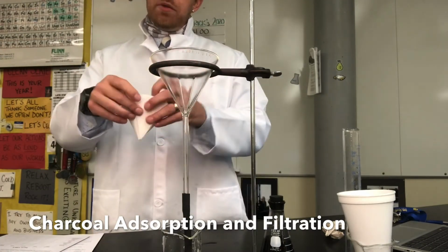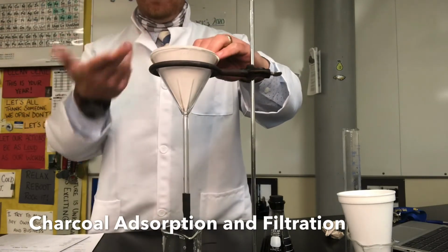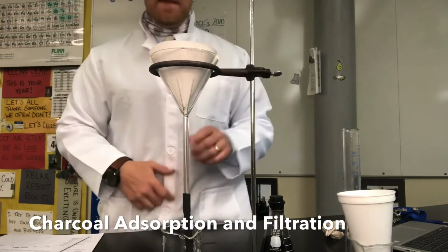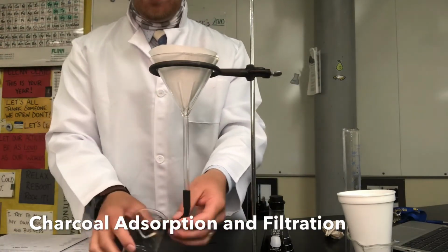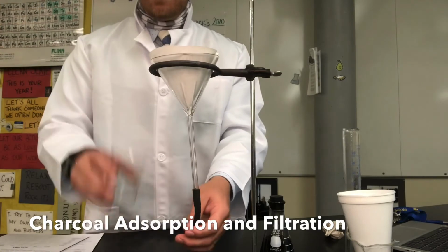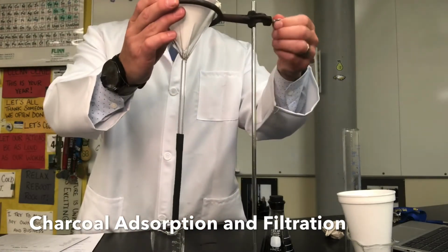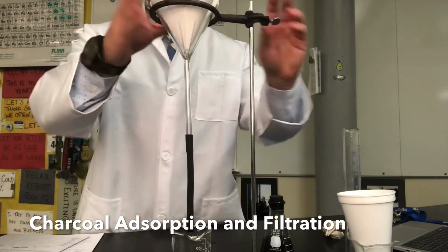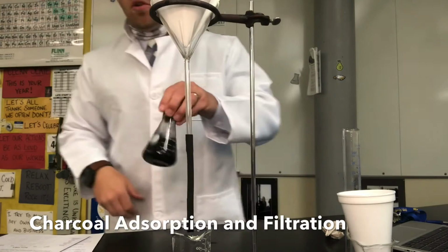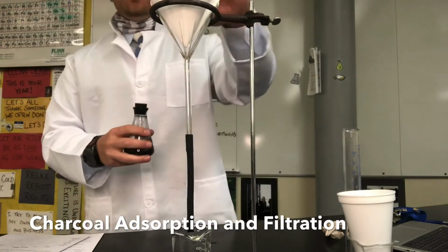So if you mess with it enough, you're going to see that it's going to fit right into our funnel nicely right there. Okay? Now what you don't see maybe at the bottom here is that I have a nice clean rubber tube coming from the funnel, and I have a nice clean beaker. So what I'm going to do is I'm going to put my funnel up high, and then I'm going to slowly pour this thick black water through this filter paper.